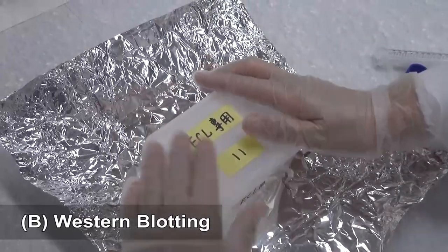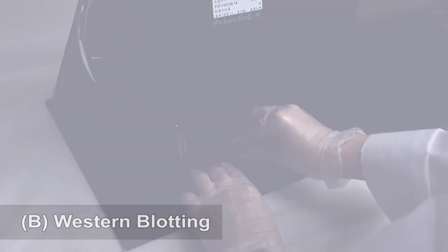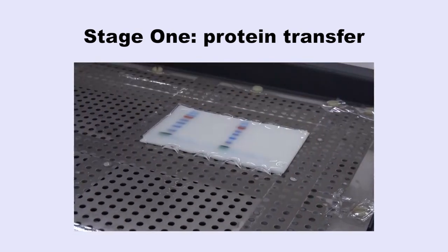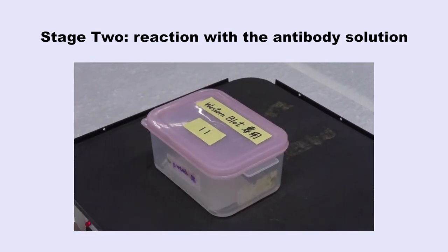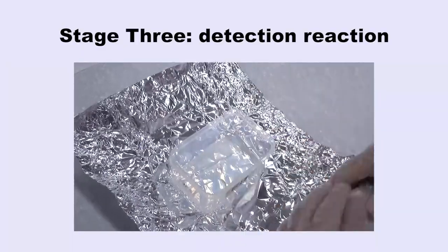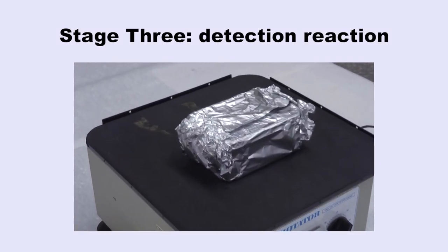Here we demonstrate how to use specific antibodies to detect specific proteins. The protocol includes three stages. In the first stage, the proteins are transferred from the gel to a PVDF membrane. In the second stage, the PVDF membrane reacts with an antibody solution. In the third stage, the reaction with the antibody-conjugated enzyme visualizes the location where the antibody binds to the specific protein.